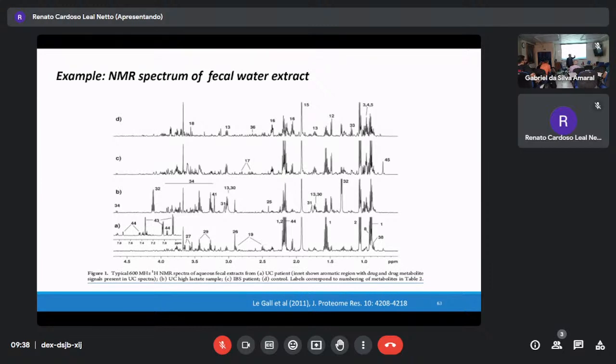Now you have to decide whether you are interested in lipid. Or I'm interested in the other part. You can divide it in half. I want to do fatty acid analysis, and the other half I send to the LCMS for analysis. If something is wrong, then I will adjust. So centrifuge, deproteination, and then gas chromatography or NMR. That's the first step.